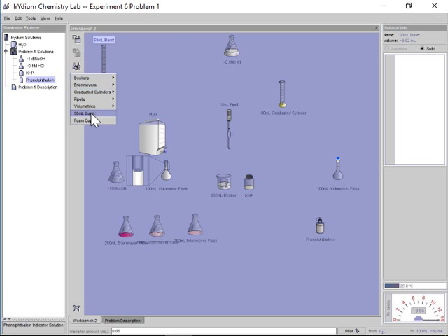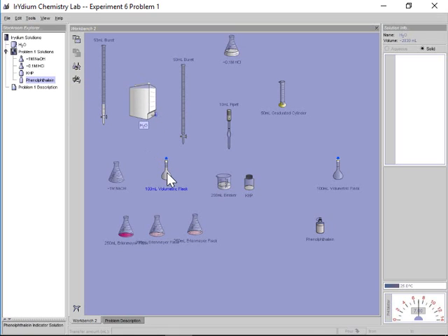But maybe I'm going to pull out a fresh burette here. And now I'm going to still put the base in the burette. I'm going to reload this one to something more than half. So let's label this one here. I'm going to pour in, let's say 40 mils, right? Maybe that'll be enough for 3 trials. I don't know. We might need to refill it later on. So keep it on the side so I know what it is. You would definitely label all these. This is now my diluted NaOH.